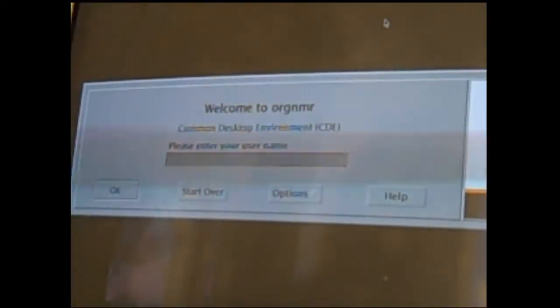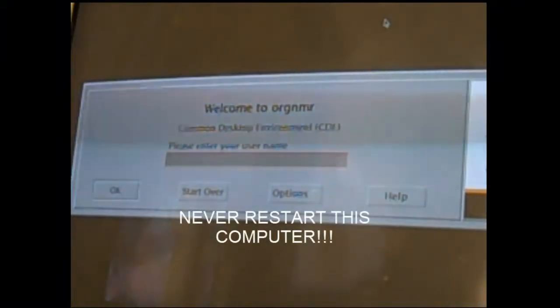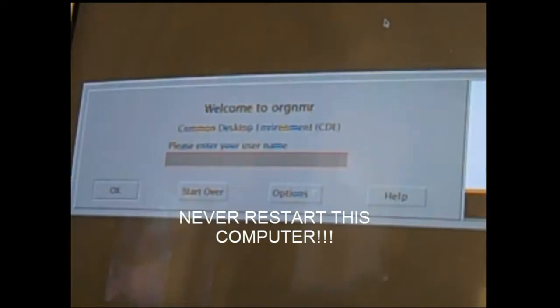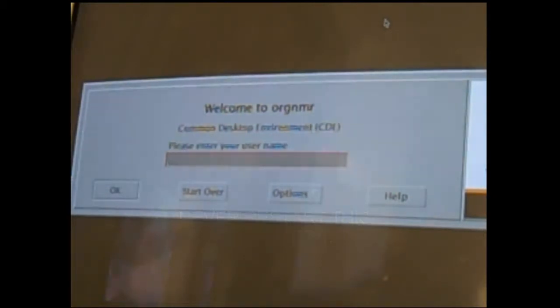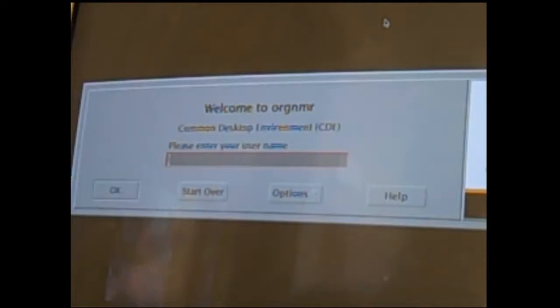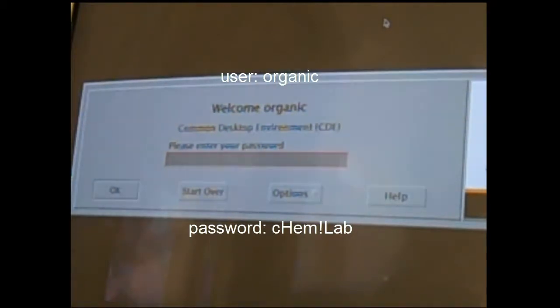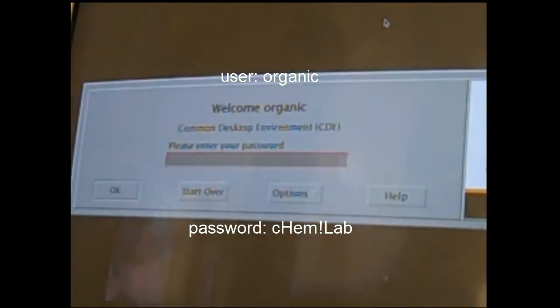Welcome to the TA training video on how to use the NMR and run a Proton NMR. The first thing you'll want to do is log in to the NMR computer using the user and password information found to the upper left of the computer. The username is organic and the password is kim!lab with some mixed capitals.